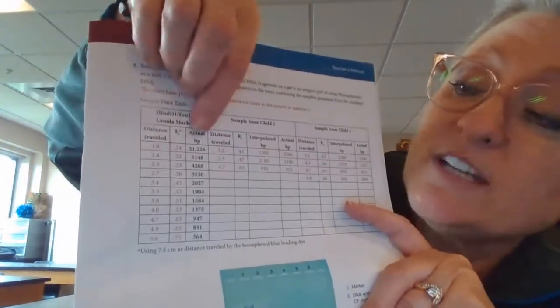And then what we did with that, don't look at the rest of this yet. What we did with this information is we came over to this page on your lab, this one right here. And this is probably the trickiest part of this whole lab, to figure out what's the best fit line of known base pair lengths, and then to interpolate our own data. So what's a base pair length? The base pair length is how long is that little piece of DNA so that it would get stuck. The biggest pieces got stuck way back here at the beginning, and the smallest pieces traveled the furthest. So what we're looking for in this actual BP is the actual base pair length.